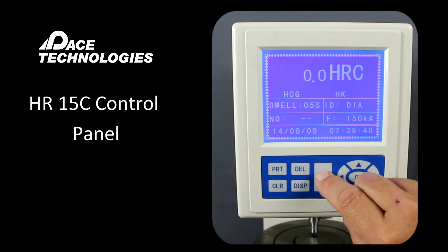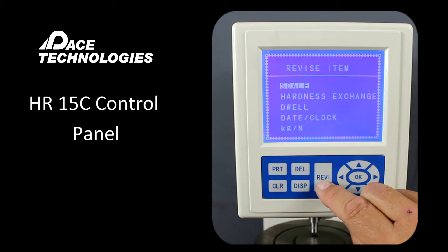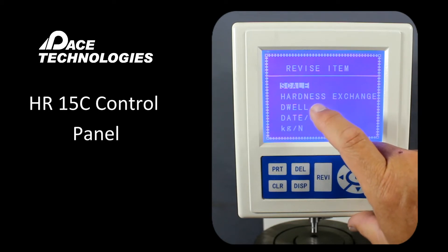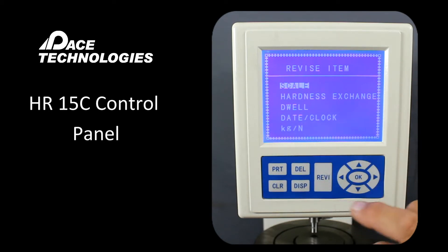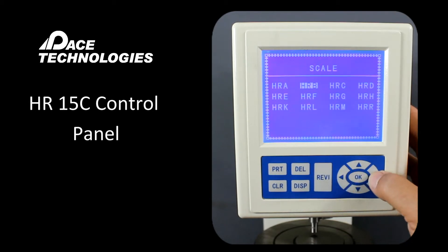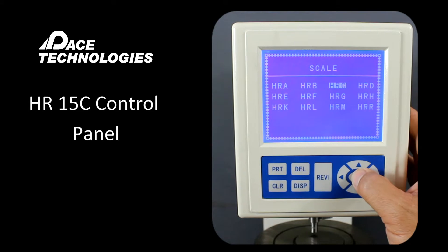If we wanted to change any of these parameters, we could go into REVI and press that key. Now you can see the items that we can change, including the scale, the conversion, dwell time, and the date. We can scroll to the different scales here. We'll leave it at HRC.